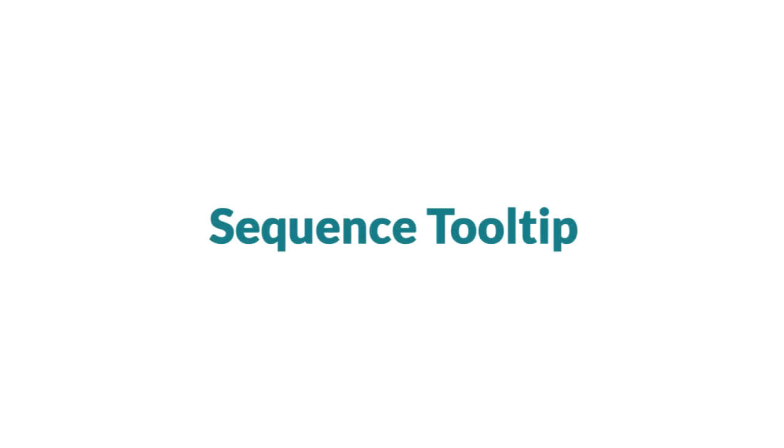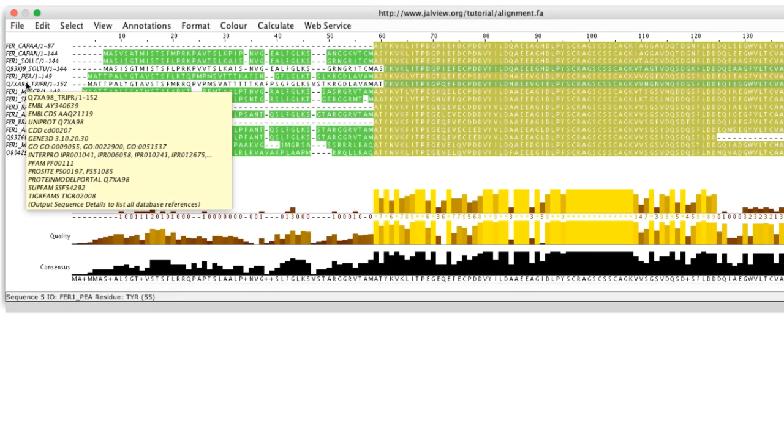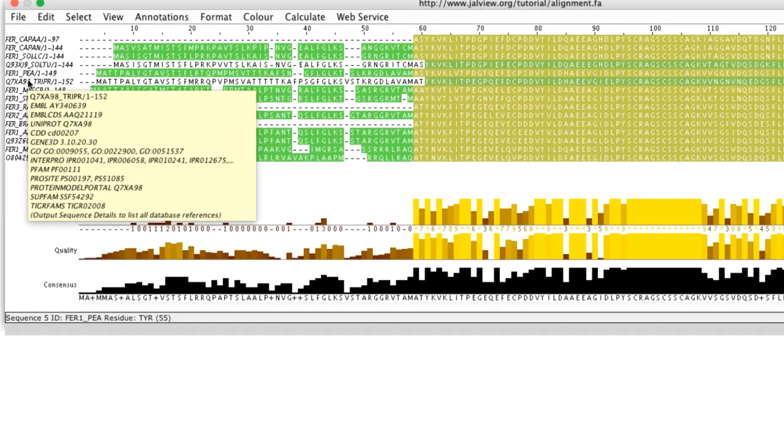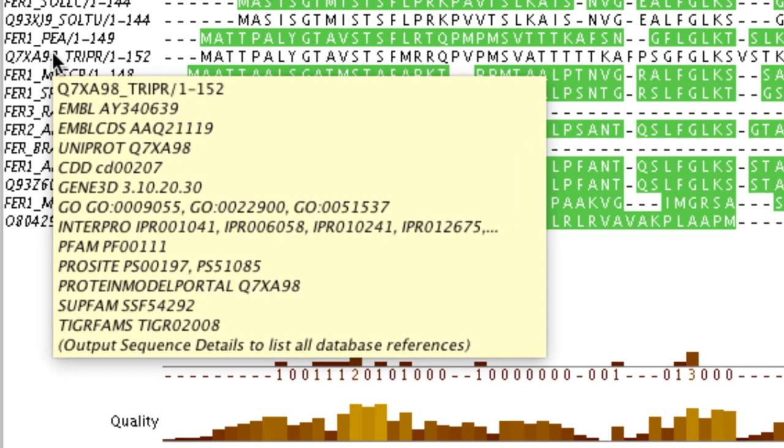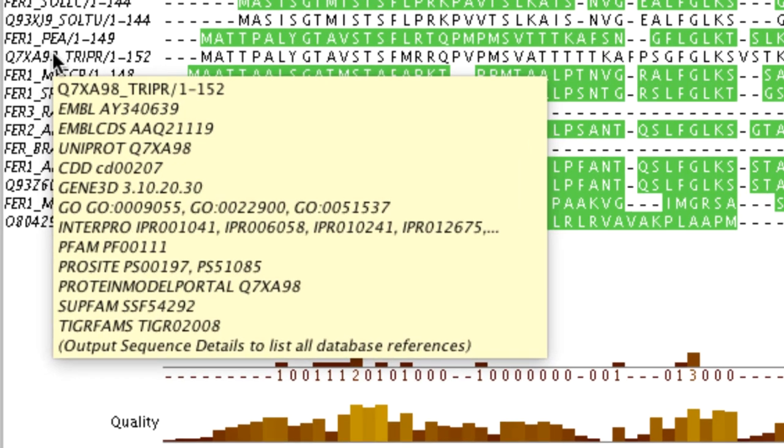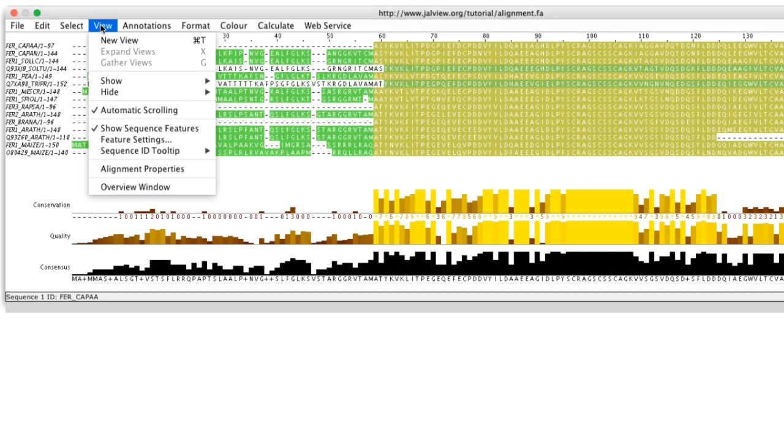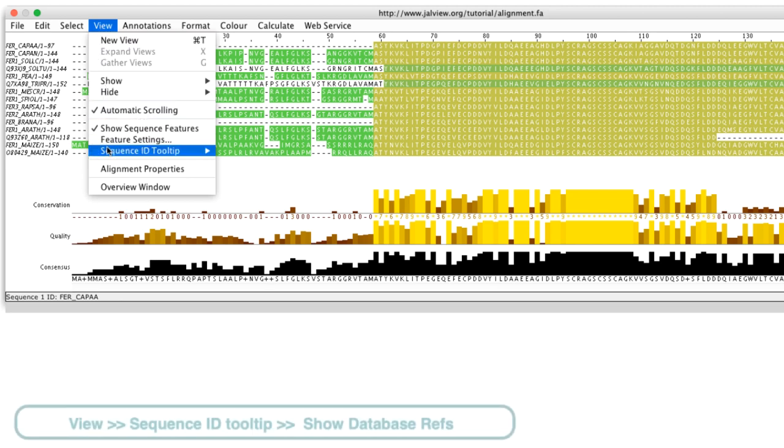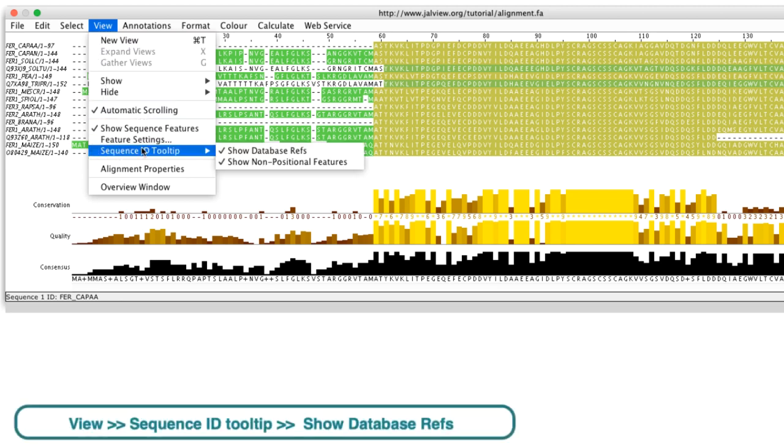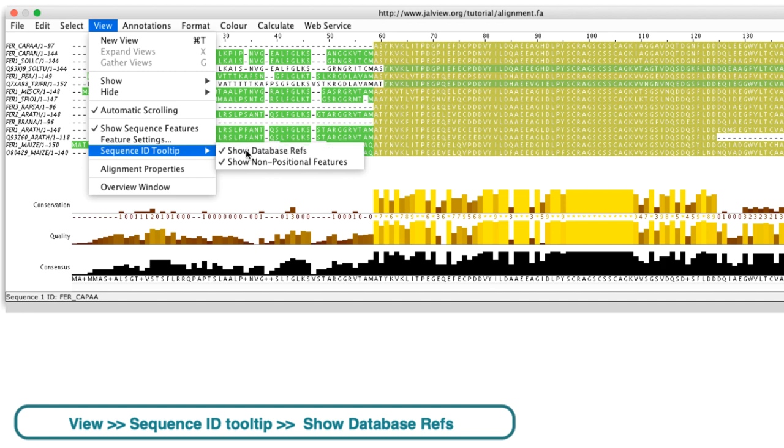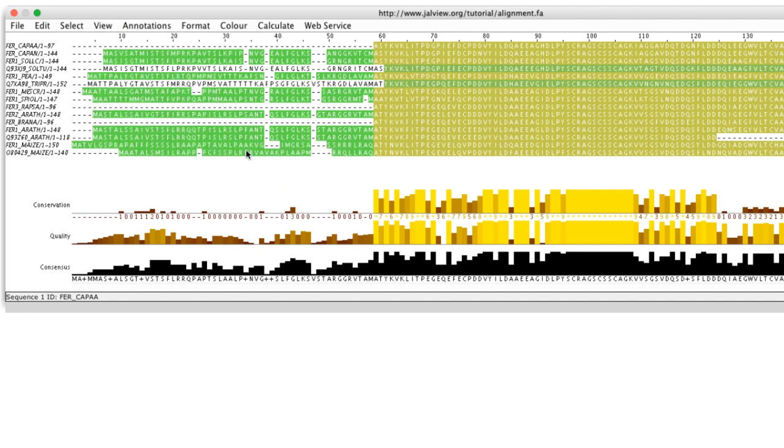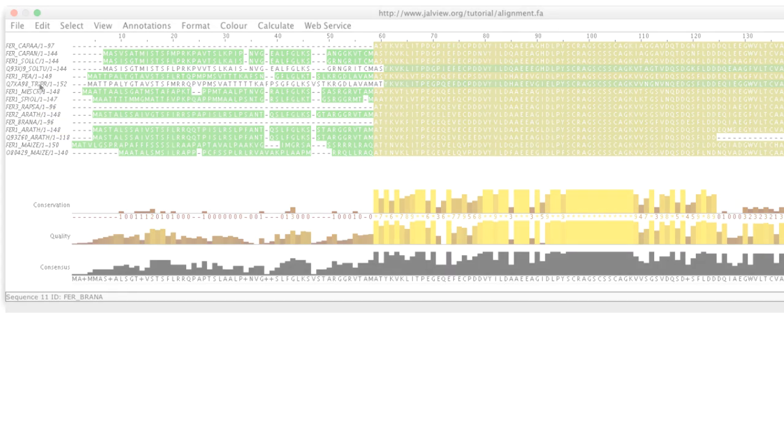Placing the cursor on the sequence ID will open a tooltip which lists additional information about this sequence. This option can be turned off by going to the view menu in the alignment window and selecting sequence ID tooltip and unticking show database refs. When I place the cursor over the sequence ID, the tooltip now includes only the sequence ID and the start and end residue number.